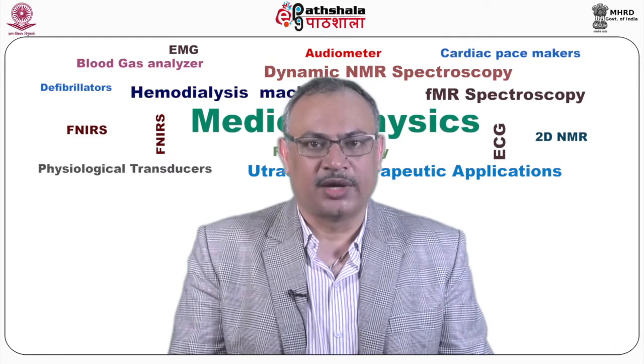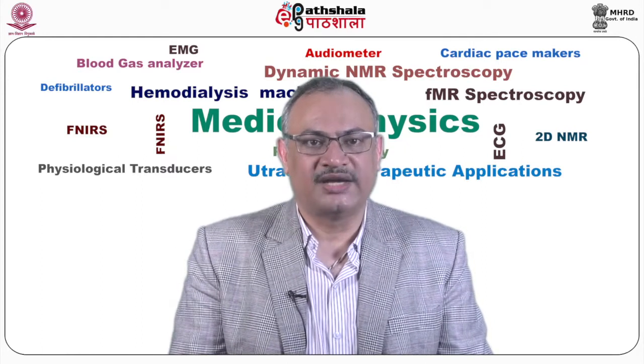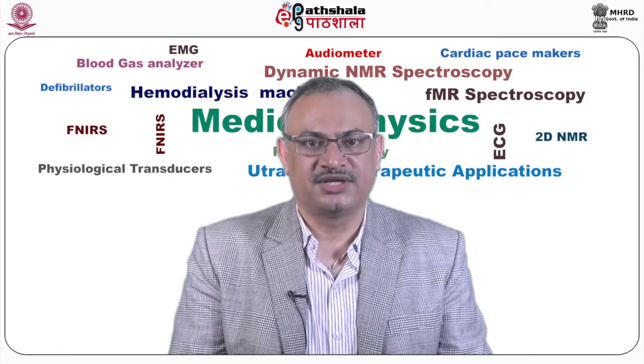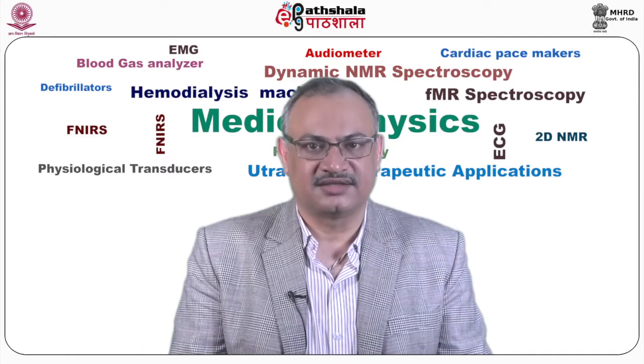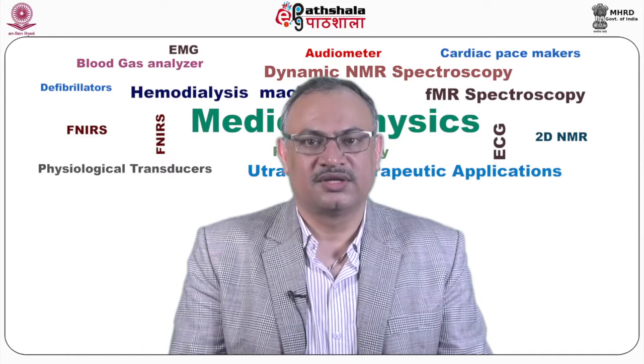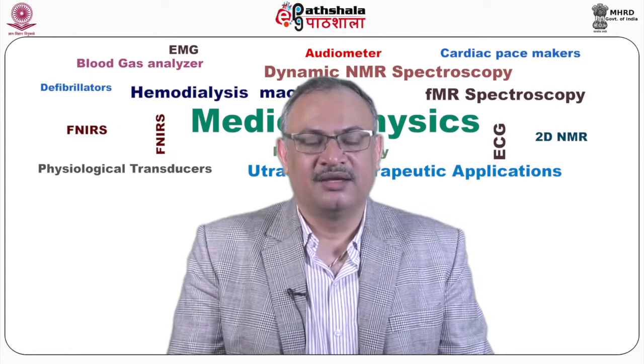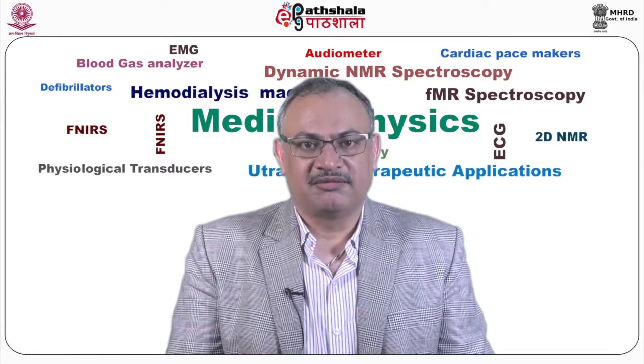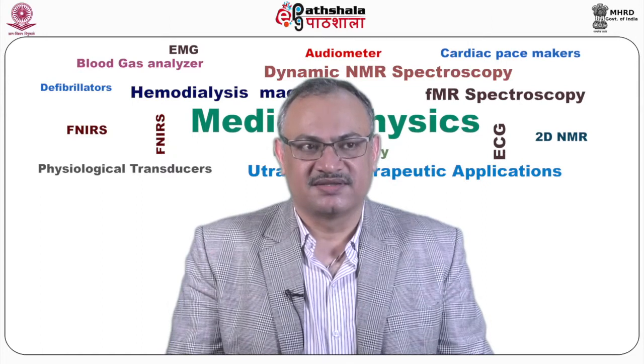Saturation can be avoided by waiting 4 to 5 times T1 between scans to allow sufficient time for spin lattice relaxation to restore thermal equilibrium. In modern experiments, this is also achieved by gradient purge pulses.